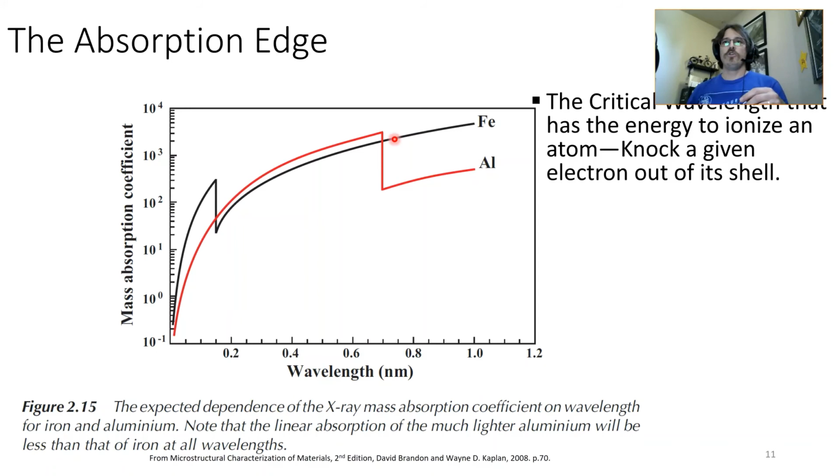And we see that aluminum and iron have different edge absorptions, and I'm guessing this is K. At the very least, it's the same radiation that's being talked about, I believe. Anyway, different absorption edges, okay? If we look at it, and here we are, they're the little cusps.